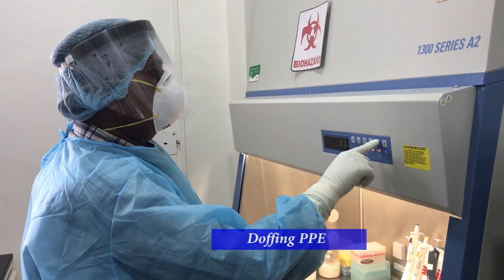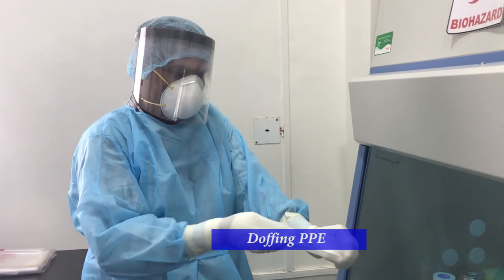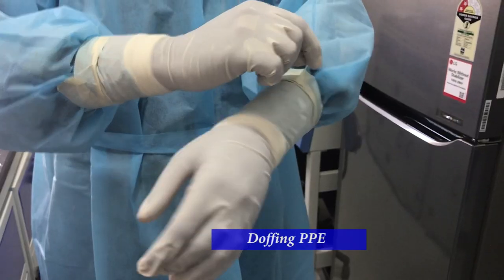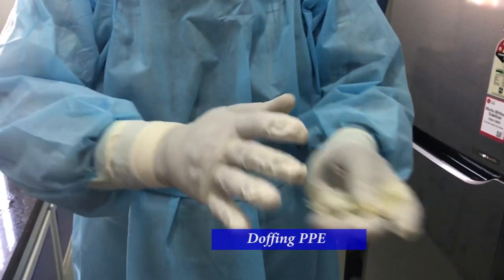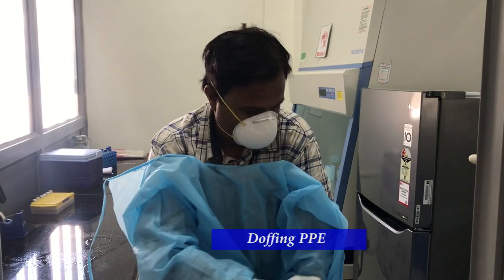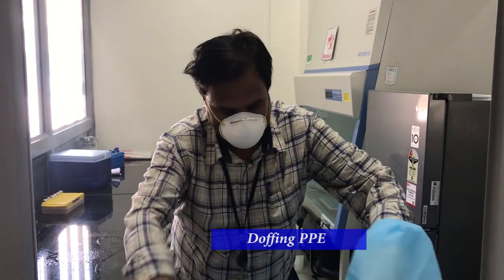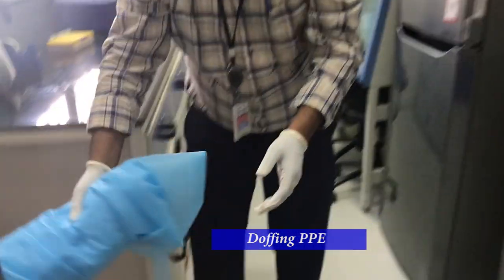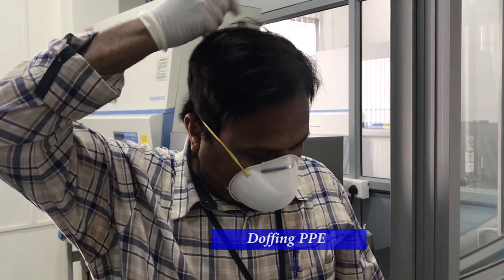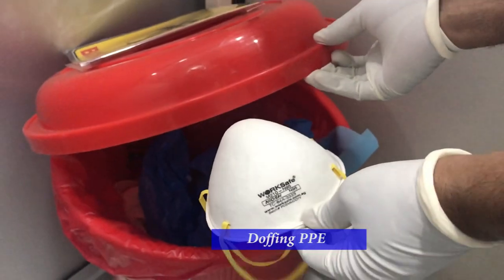After this, doff PPE as shown in the following order. Discard the outer pair of gloves in the biohazard bin. Remove face shield and the head cap, the tape of the inner pair of gloves, the lab apron, removing carefully inside out, the shoe covers, N95 mask as shown with the lower elastic first with one hand and the upper elastic with the other hand. And finally, the inner pair of gloves into the biohazard bin.